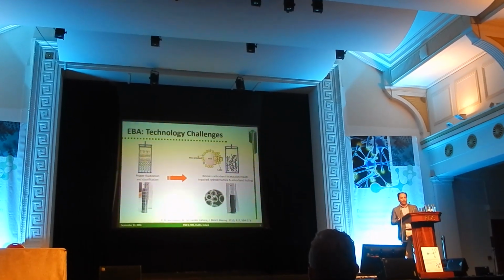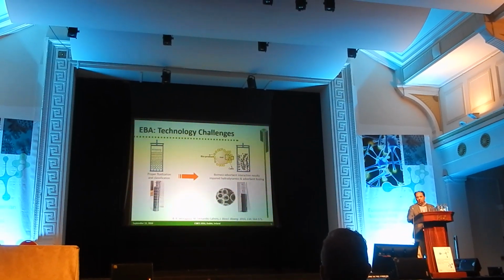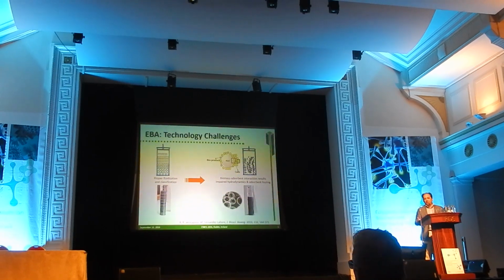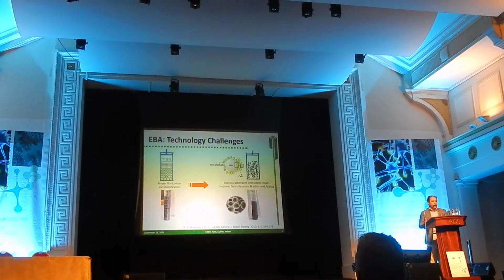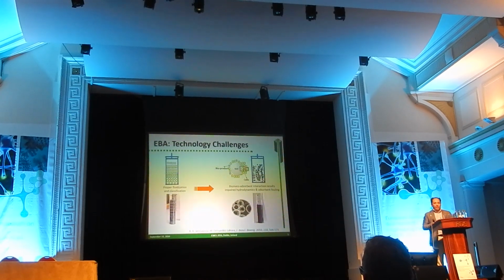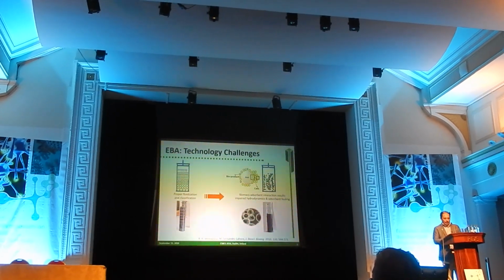You know from distillation or chromatography theory, for example, that the larger the number of plates that you have in there, the better the performance. In the case of analytical chromatography, this is seen as better resolution or separation between peaks. In the case of an on-off technique, like expanded bed chromatography, you would see sharper breakthrough curves, which is usually the way in which we look at the performance of these systems.